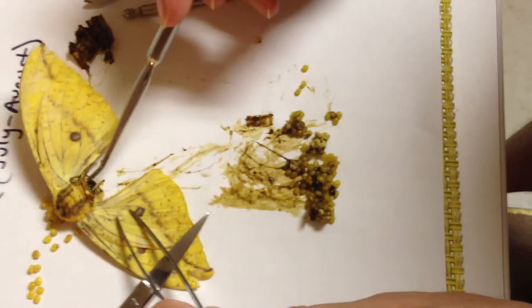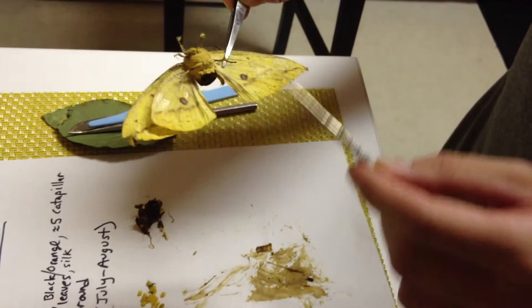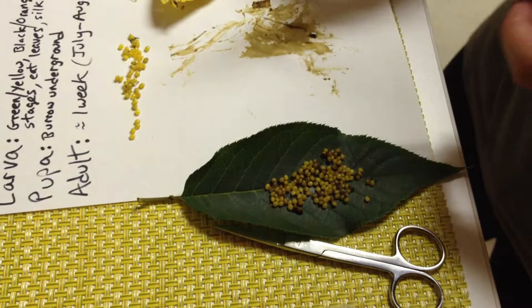This is what's left of the Imperial Moth — we have four wings, we have one, two, three, four, five, six legs, some vestigial mouth parts underneath, two eyes, a soft fuzzy head. And these are all the eggs I scraped out of the abdomen, and these are the ones that were found before that were actually laid. So this is Eacles imperialis, the Imperial Moth.